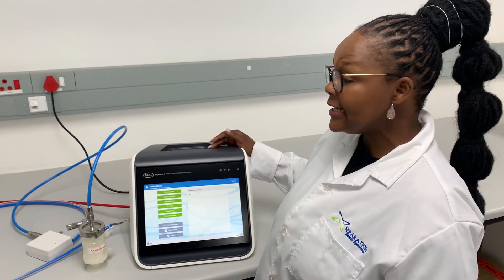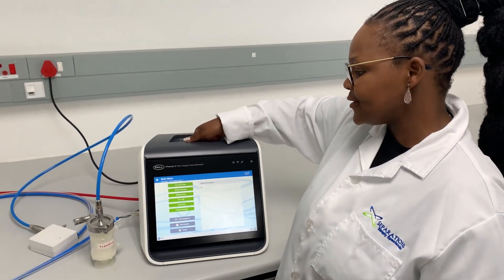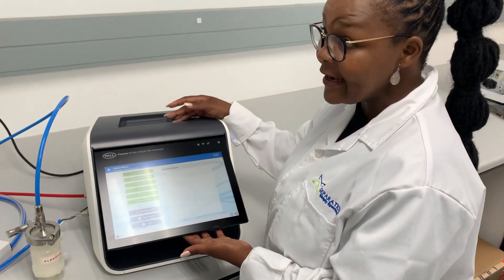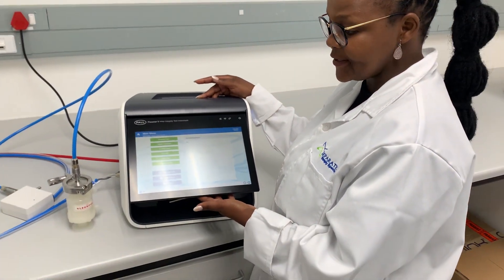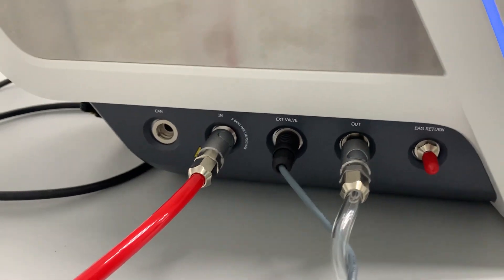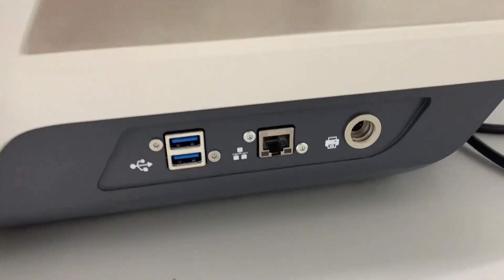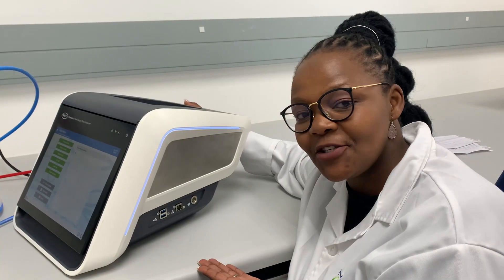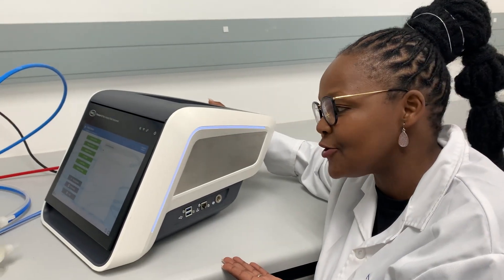The Flowstar 5 can easily be moved around using the handle. The touch screen is adjustable for ease of use and limits the reflection of light. On the left hand side we have pneumatic connectors, and on the right hand side we have electronic connectors. The lighting on the side has been designed for an easy-to-read status update from across the room.